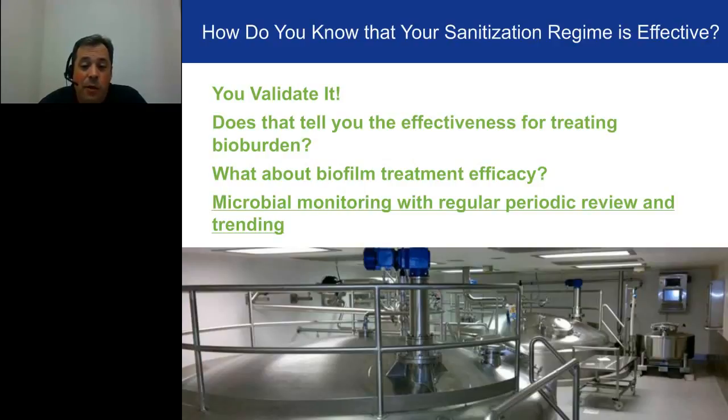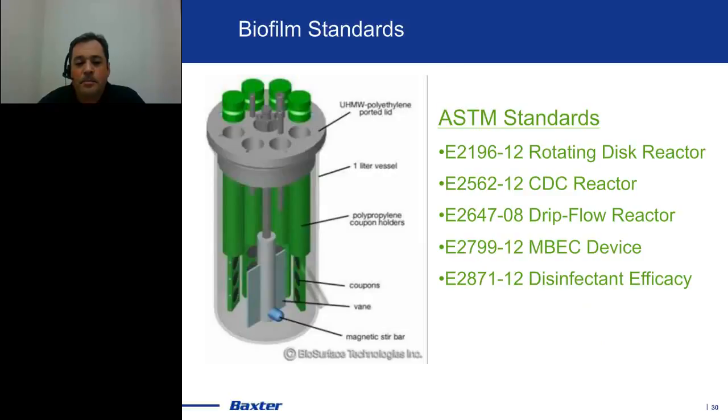That said, those of you who put microbial monitoring and periodic review, that's my preference for really being able over long term to truly tell if you're in a state of control. It's really that long-term trending that gives you a better idea, I think, as to whether you're in overall control. So both of those answers are correct answers. Obviously, the validation is what's currently being done. Hopefully, the companies that are doing this are doing really good jobs with their trending so that they can stay on top of that control.